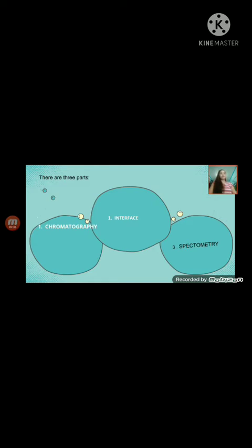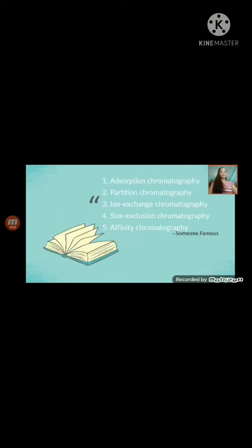The various mass analyzers used are the quadrupoles and quadrupole ion traps, time of flight, or TOF, or the time of flight reflection, or the TOFR, and the ion cyclotron resonance, or the ICR, and the mass analyzer.